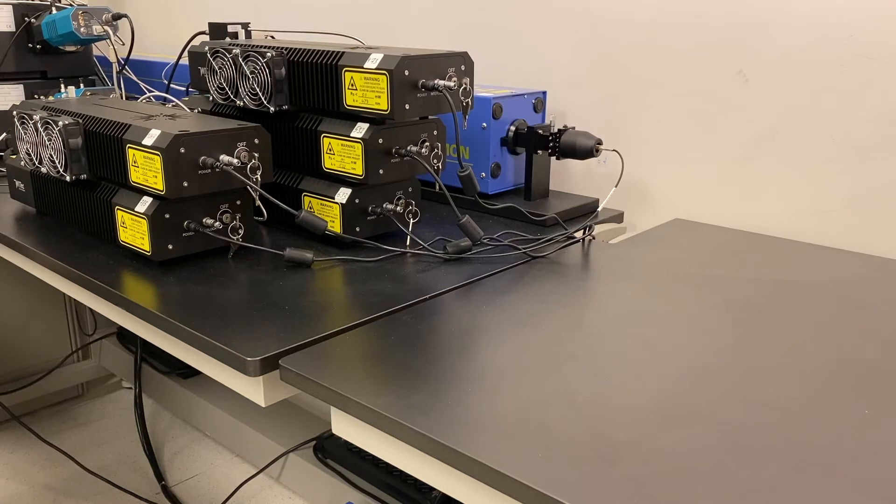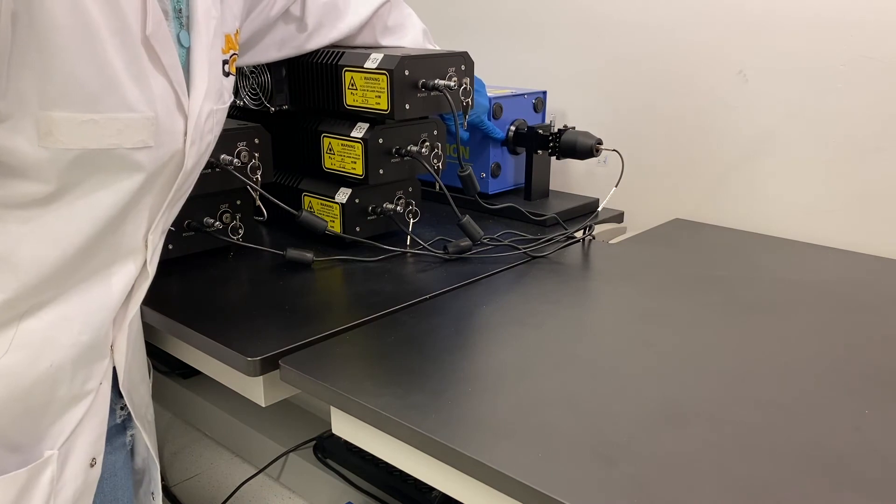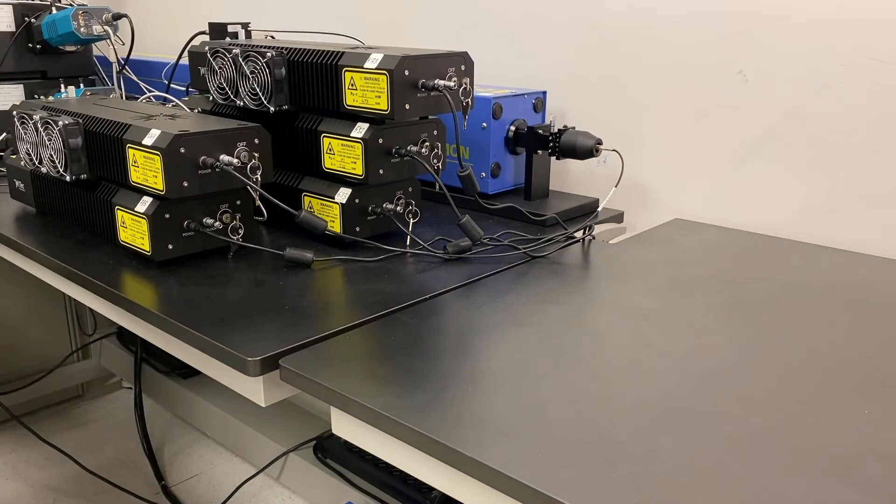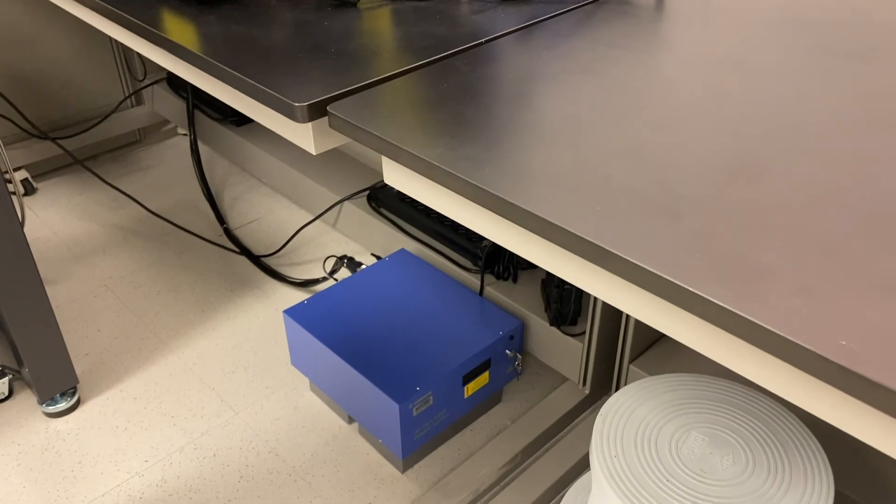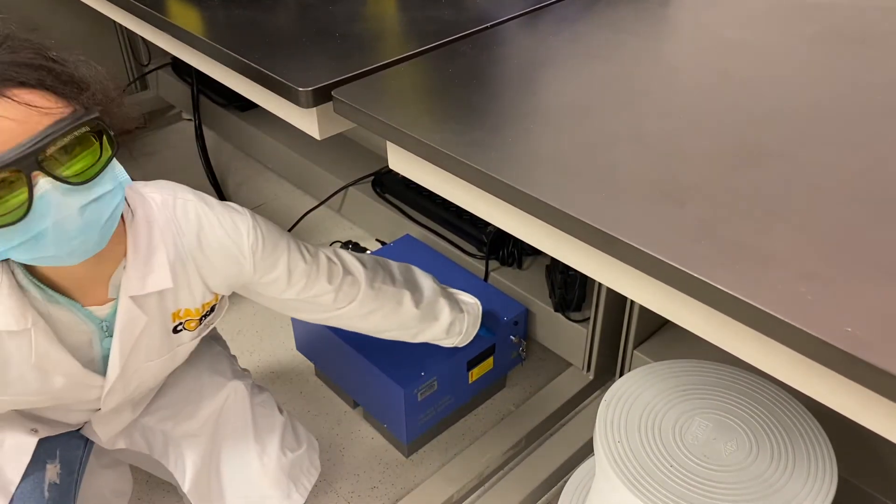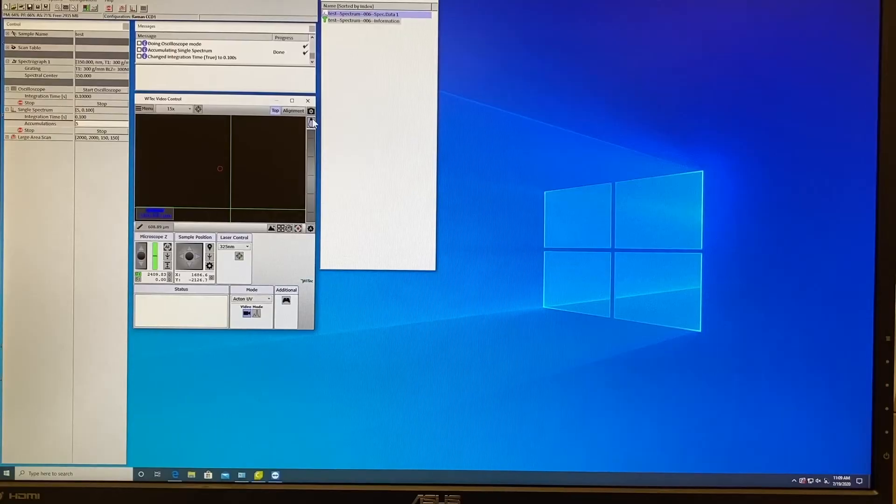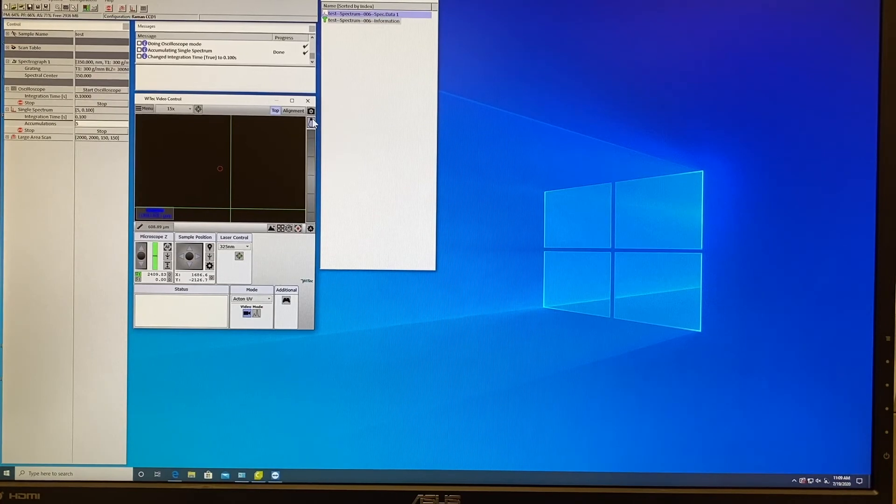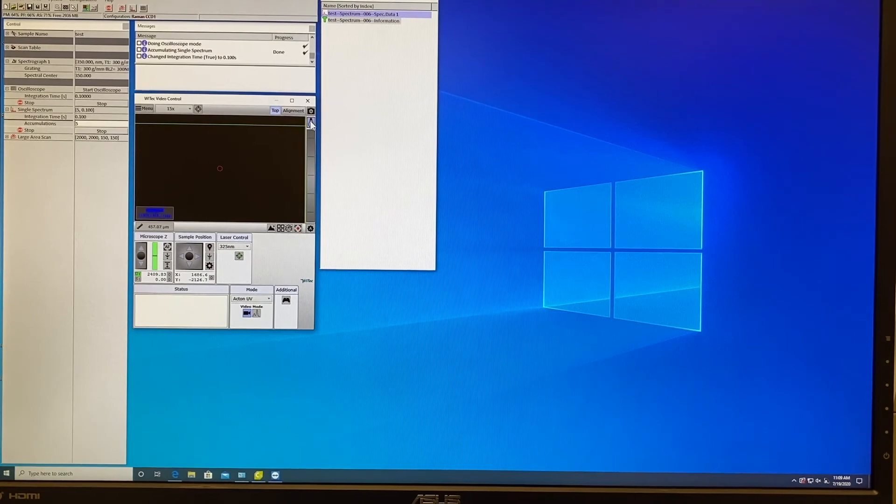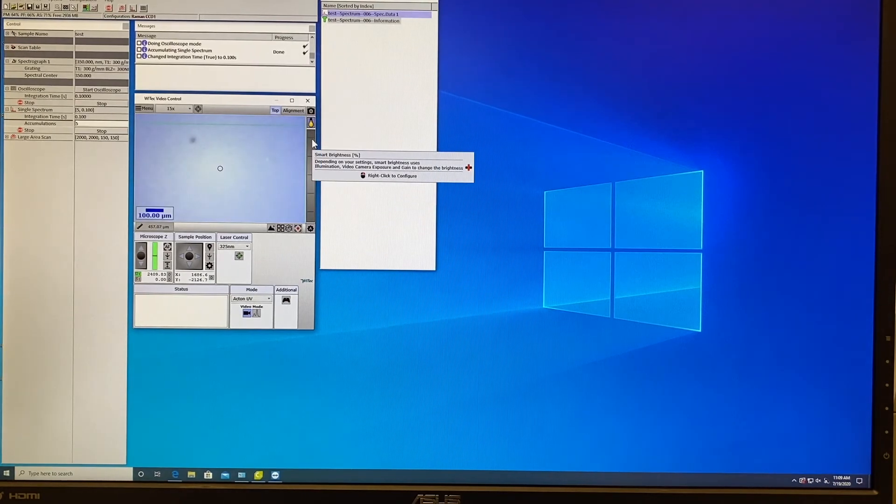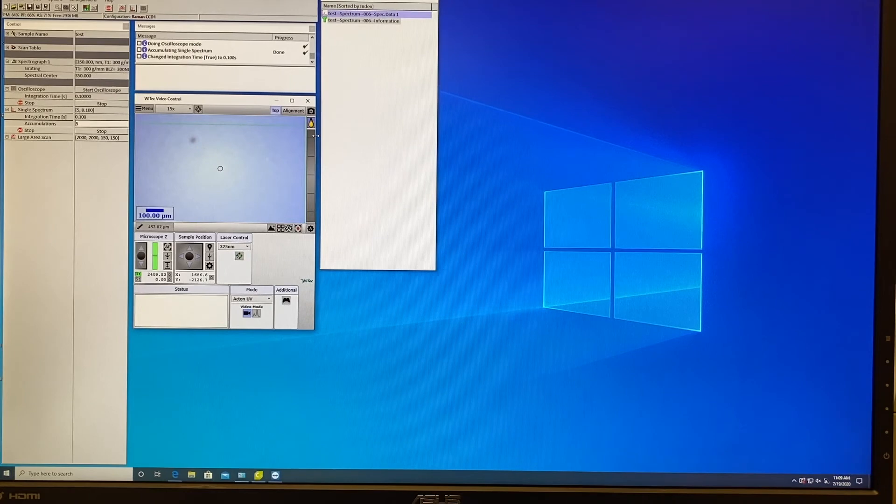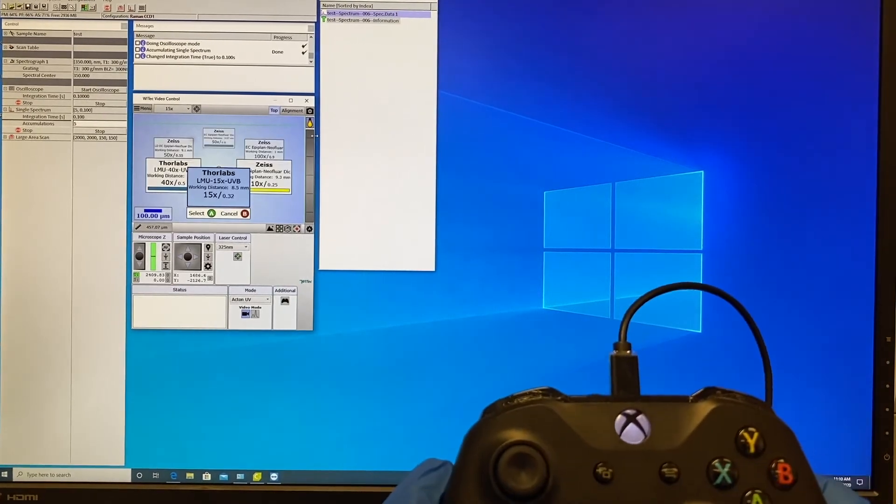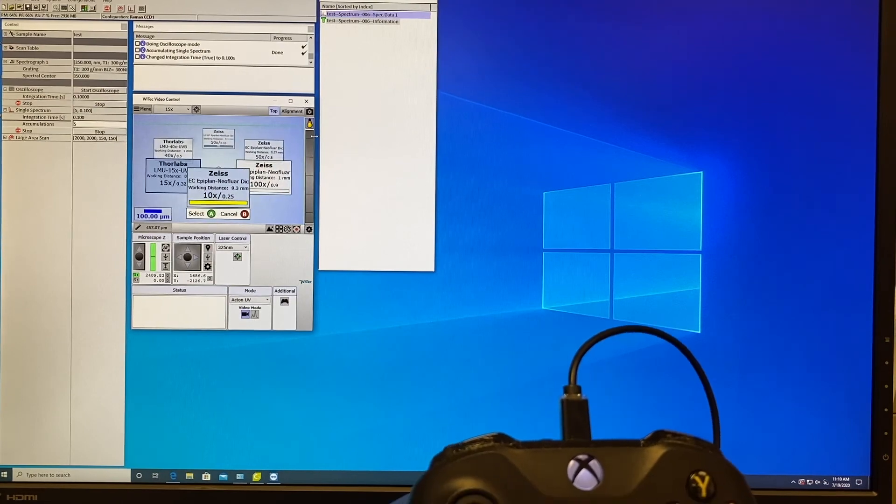After you finish your measurements you have to close the shutter of UV laser and switch off the laser by turning key from on to off. Once the shutter of UV laser is off you can turn on the illumination on your sample and to finish you have to press A and go back to Objective 10x.